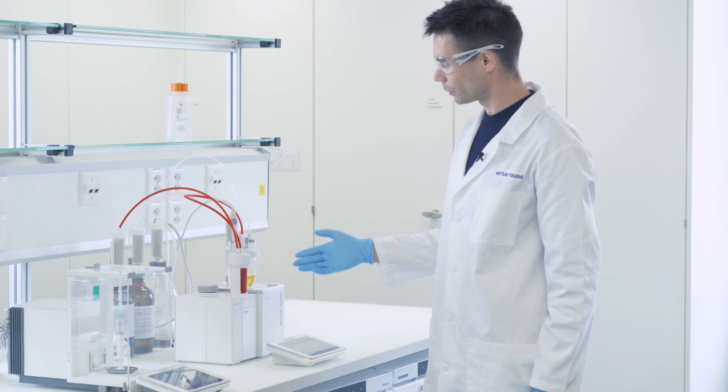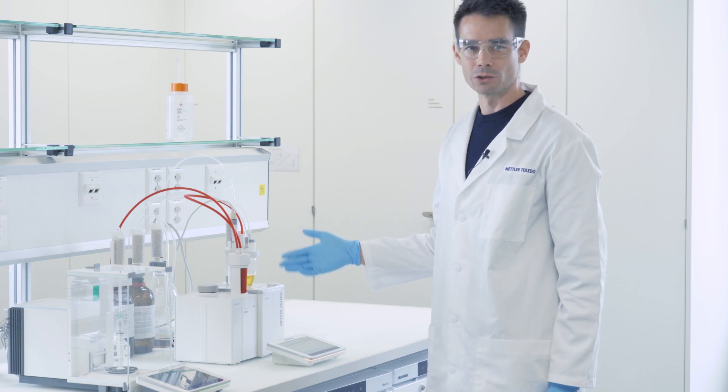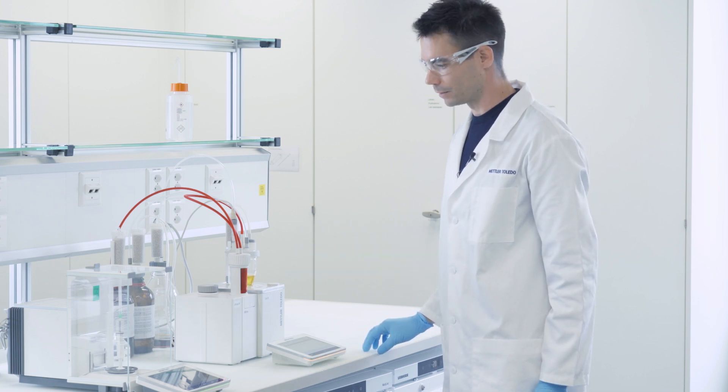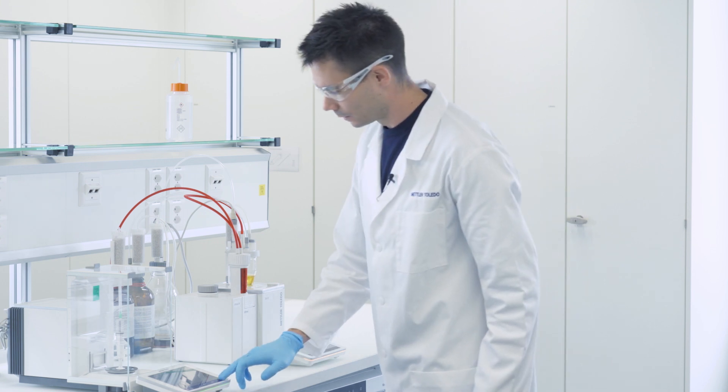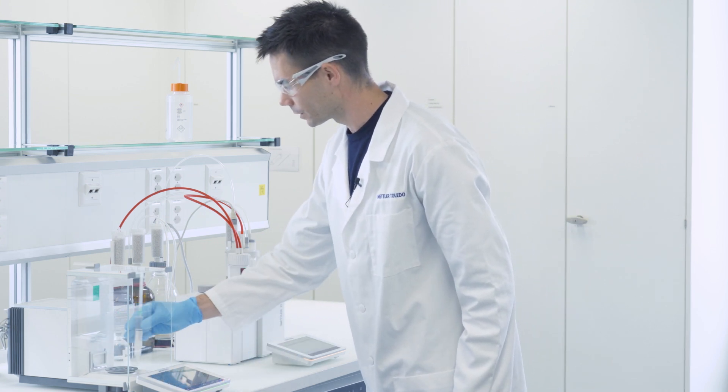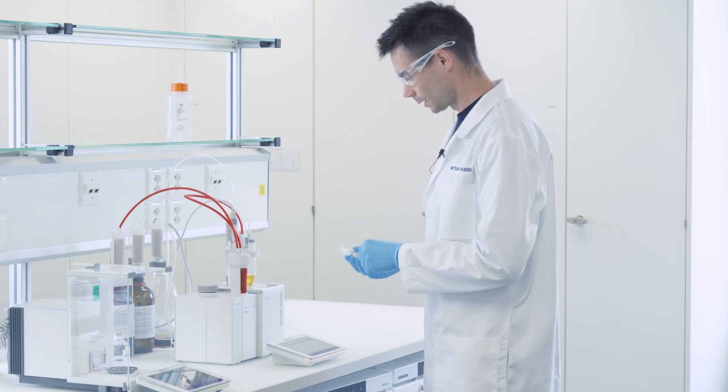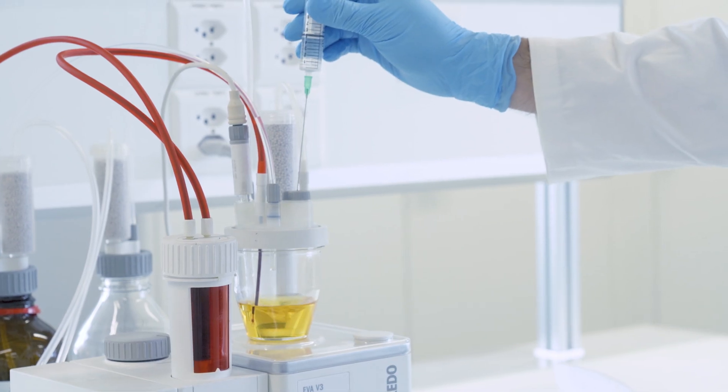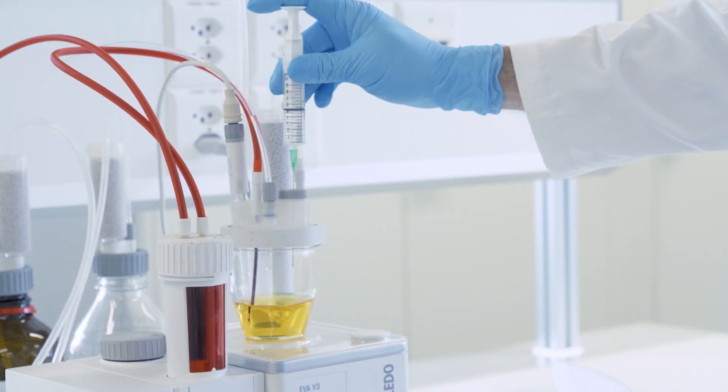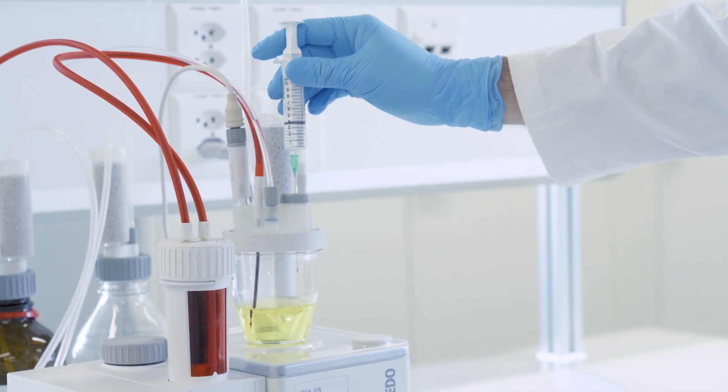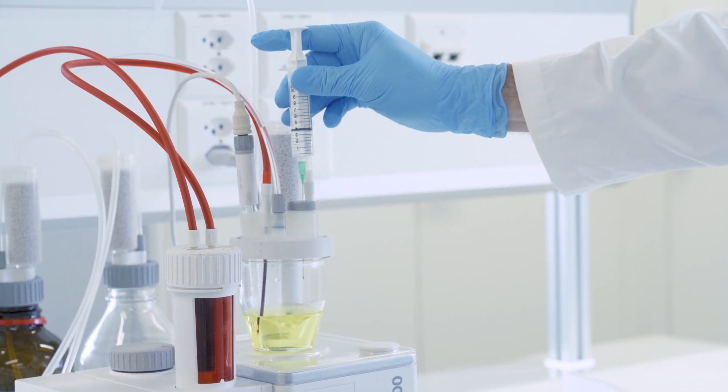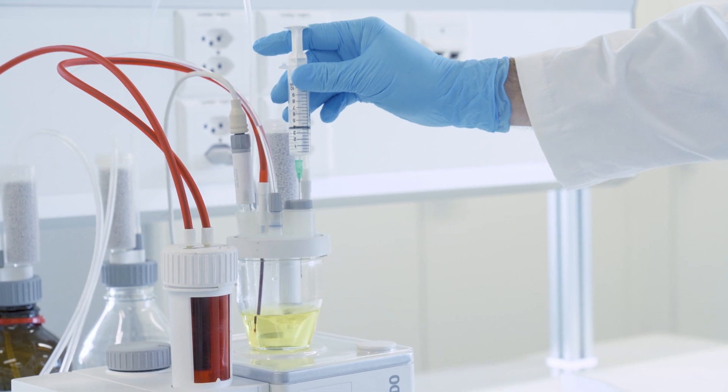From now on the titrator will detect any water that we inject and it will start the titration as soon as we have injected the sample. We get our syringe and inject an appropriate amount of the sample. Make sure to pull the plunger back a little bit to avoid a droplet at the end of the needle.